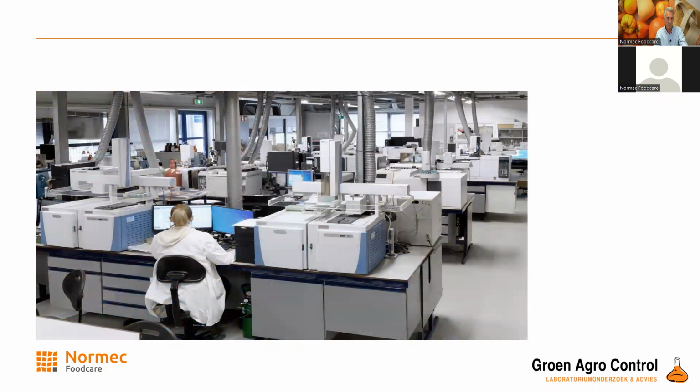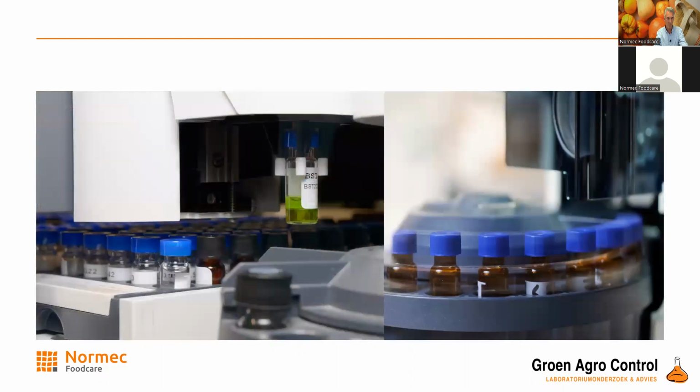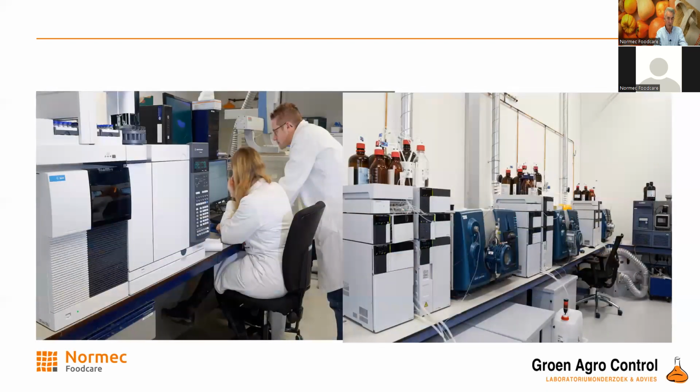Another view of the laboratory. You see a lot of equipment. It's amazing because it's really expensive equipment. Normally you can see it working at really high speed. Sometimes the small bottles are in the machine. This is part of the LC MSMS.